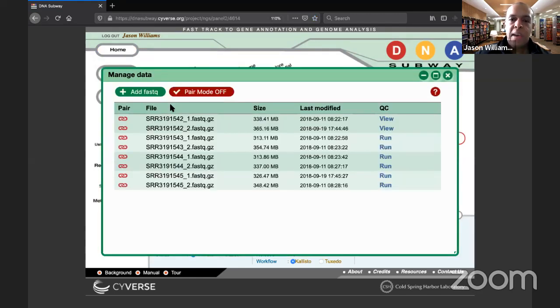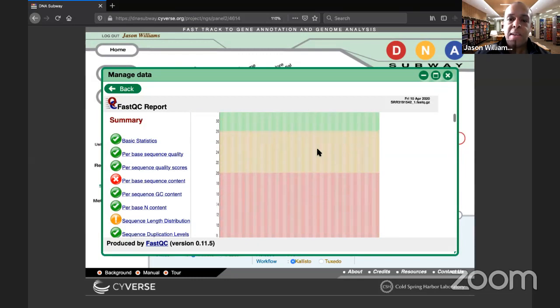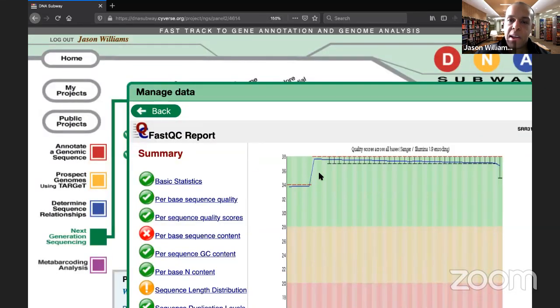What we did last time was we imported sequence data from all of these stem cell sequences that we generated. And we clicked on view in order to look at the quality of these. And we covered in the last video, go back and watch it if you missed it, what this means. These are actually really high quality sequences because the Phred score is really pretty high.